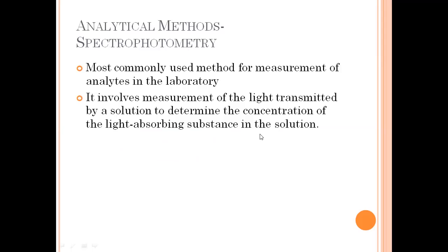So spectrophotometry, it's very important that it uses that EMR. Spectrophotometry is one of the most useful methods of quantitative analysis, and this is the most commonly used method for measurement of analytes in the laboratory. There are many fields in science that use this analytical method.